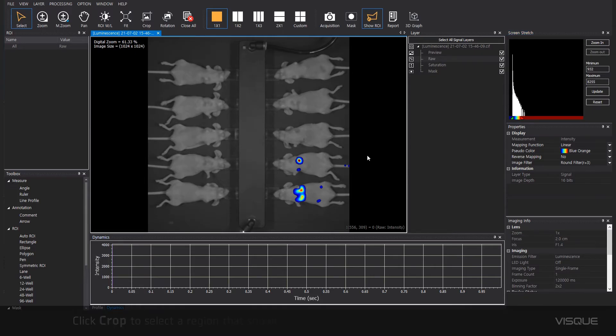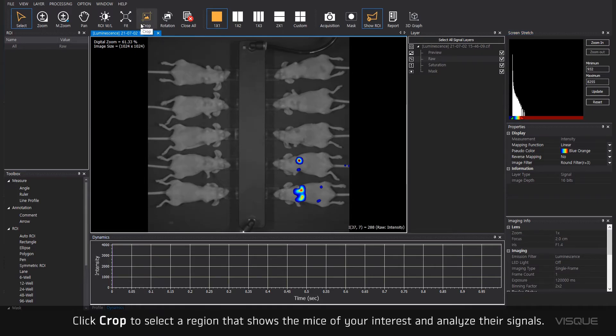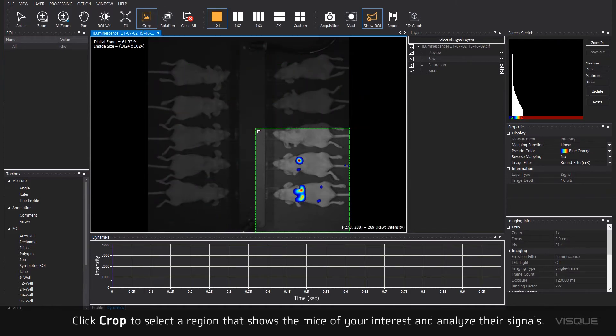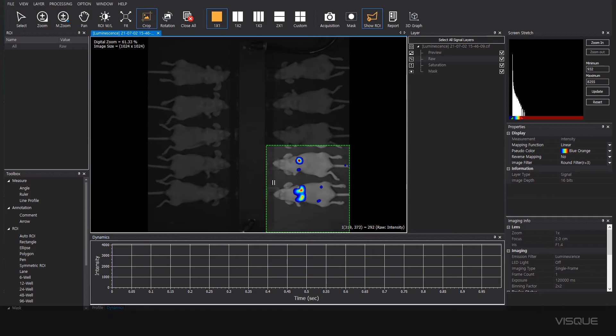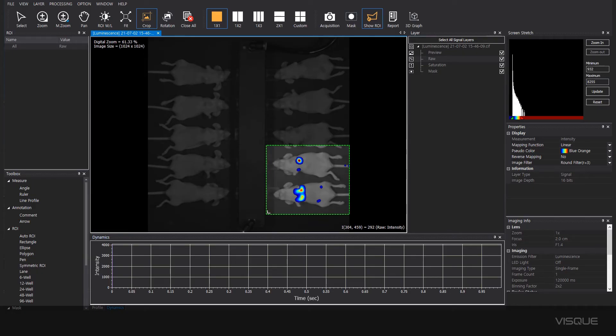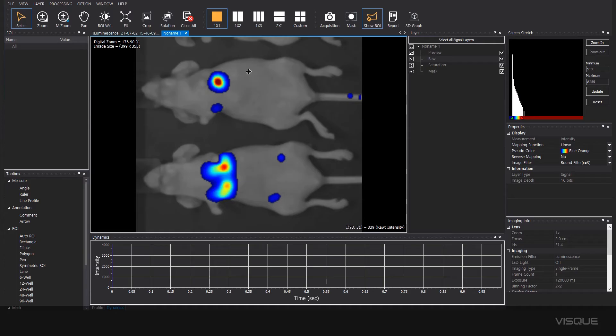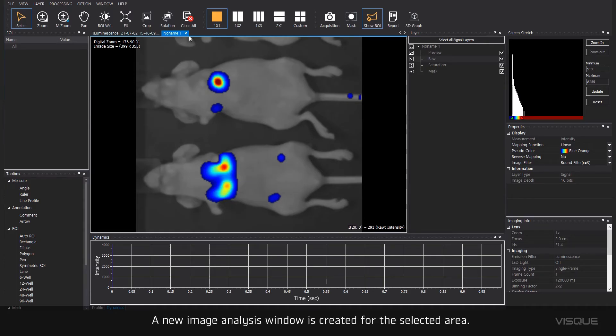Click Crop to select a region that shows mice of your interest and analyze their signals. A new image analysis window is created for the selected area.